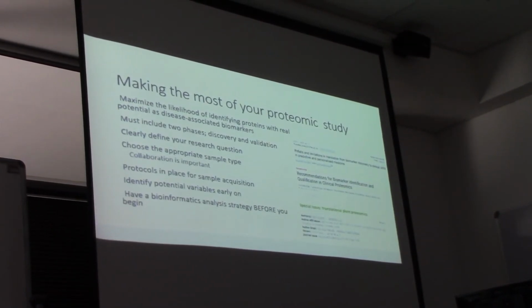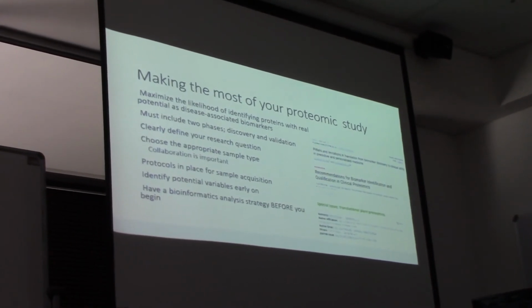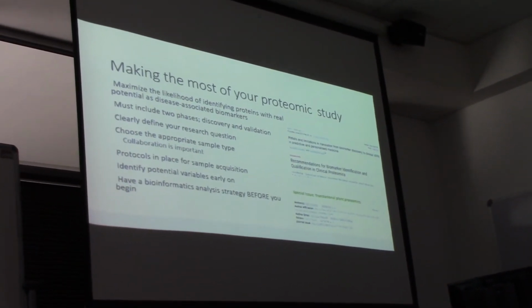I think here it's very important to talk to your mass spec analyst. Your analyst has a lot of knowledge, he has run a lot of different samples. He will know what problems there are. Probably early on he will say, this is going to be a problem, this is going to be a problem.